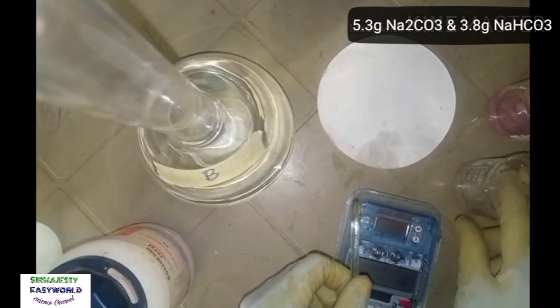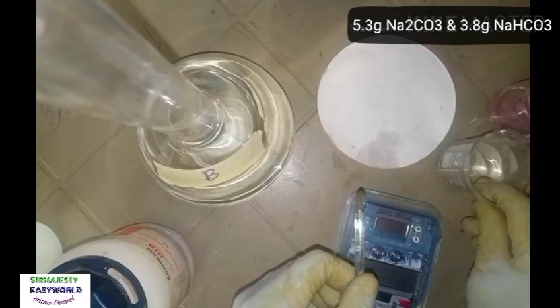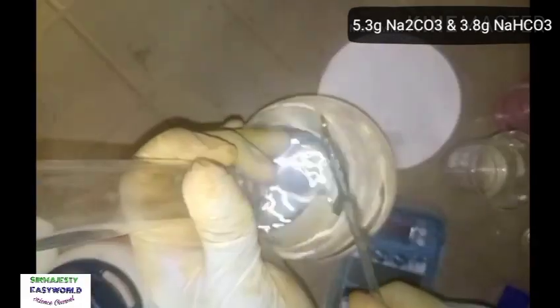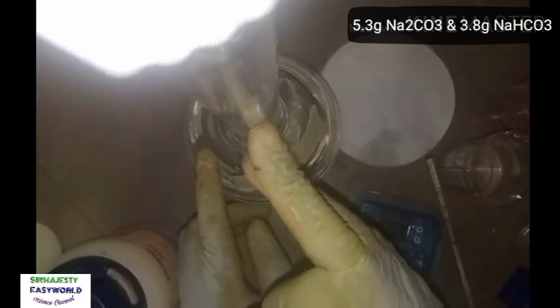When you shake it well to ensure complete dissolution, when the two have dissolved completely, you gently bring this to your volumetric flask. Now remember, you have filled it to half before. You now pour that half of 500 ml into this. It will not reach up to this mark. So when you pour the whole thing, it will not reach up to this mark. It is this mark that is 1000. So you shake well to allow you to mix.